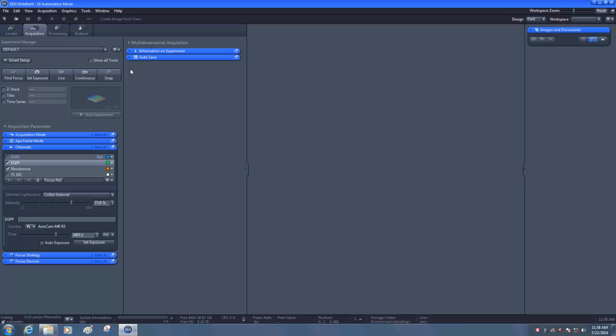The way that I overcome this issue is to set up a template experiment. If you click on the cogwheel to the right of the Experiment Manager and then select the New From menu, you will be provided with a list of template experiments. Loading one of these templates, you're immediately required to rename the experiment as your own. Note that the availability of these templates requires that they've been set up on installation, so discuss this with your facility manager or use the 1-800 support line in the comments.